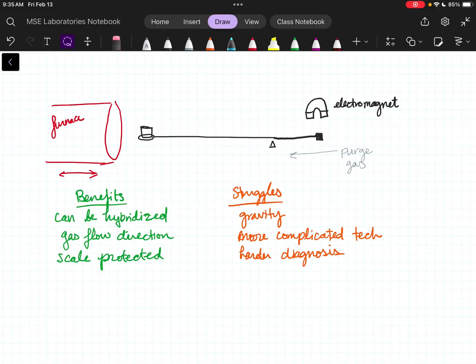Fun. And I have relied on qualified technicians to do some of our board replacements over the years as we've needed them. So I haven't had to, other than checking whether we have voltage between these two nodes, do any significant repairs on the boards specifically. On the beams, always. On the weight balance, absolutely. I've had to do a little bit of diagnostics on our furnace as well. But the boards underneath everything, I don't think I've really done that much with them.